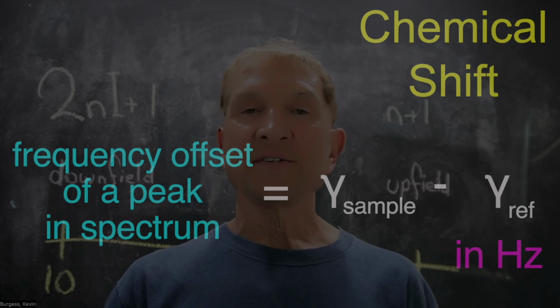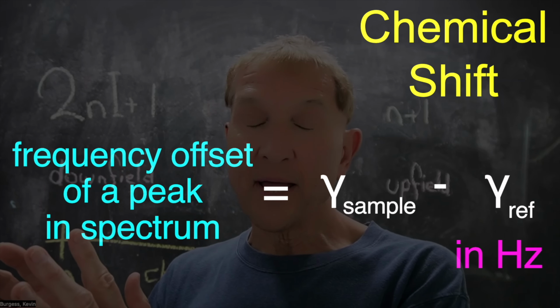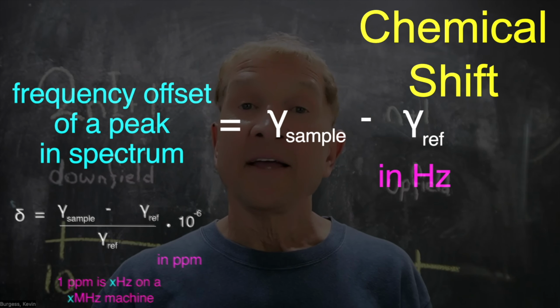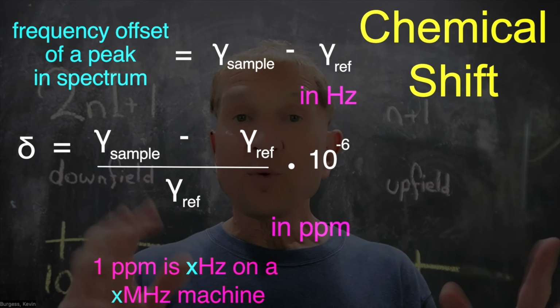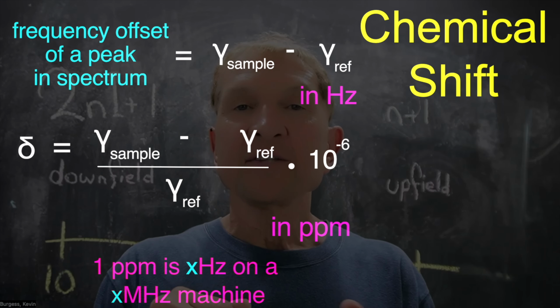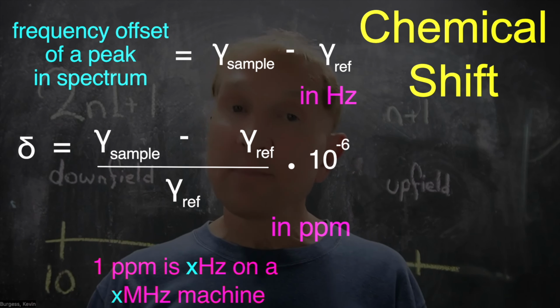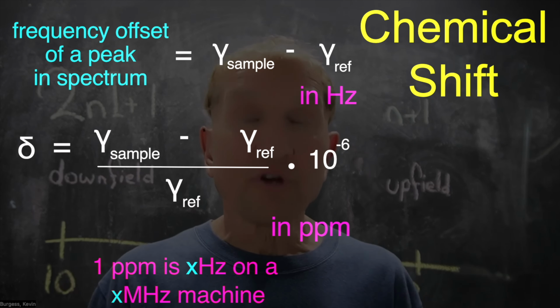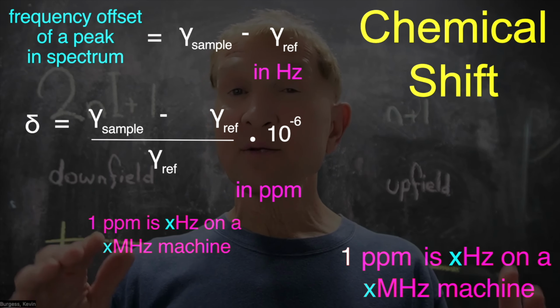Chemical shift is the resonating frequency minus the resonating frequency of a reference compound, all divided by the resonating frequency of the reference compound. Chemical shifts, delta, have no units. They're just the ratio of two frequencies. Frequency differences for different resonances in the same molecule are small compared to the absolute frequency. So chemical shifts are measured in parts per million, where 1 part per million is a millionth of the absolute frequency. Chemical shift values are proportional to the frequency associated with B0.